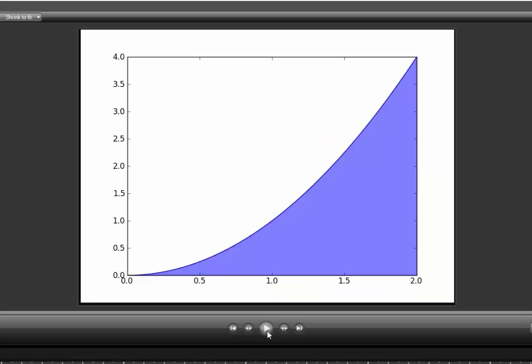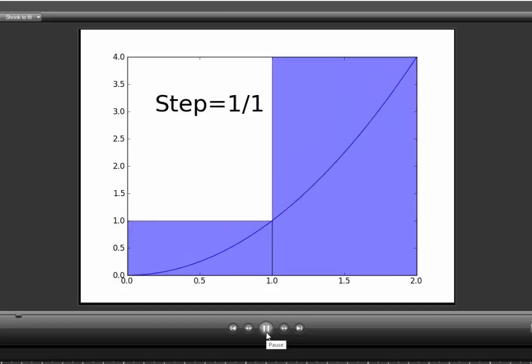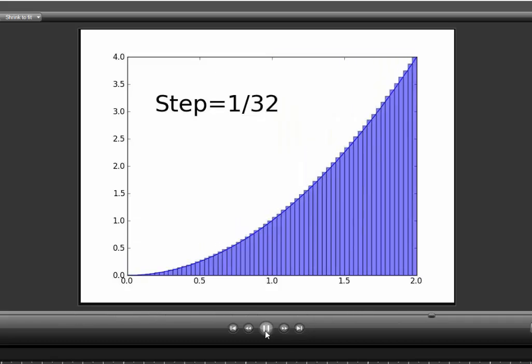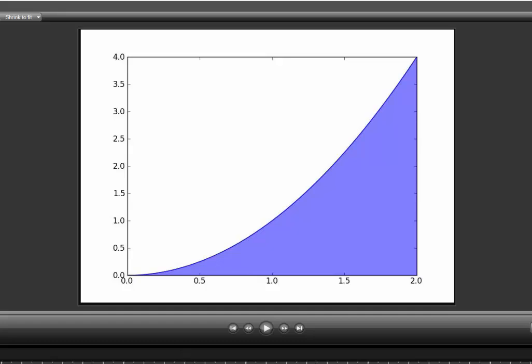In the modern day and age, if I want to approximate the area under this curve, what I would do instead of cutting it out is just simply approximate it by a series of rectangles, each of which gets more and more precise as we go smaller. Now, in practice, of course, I'm doing absolutely none of this. However, that's what any computer program is doing to figure out the area under this curve.